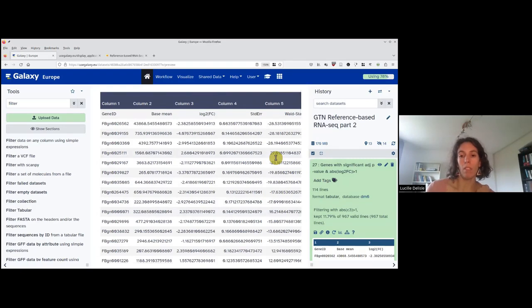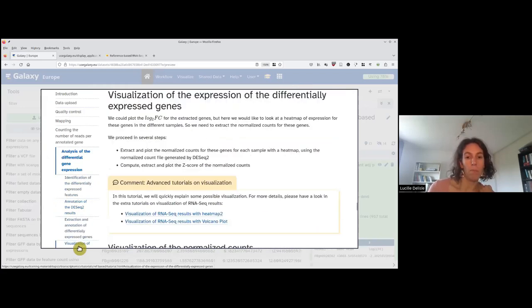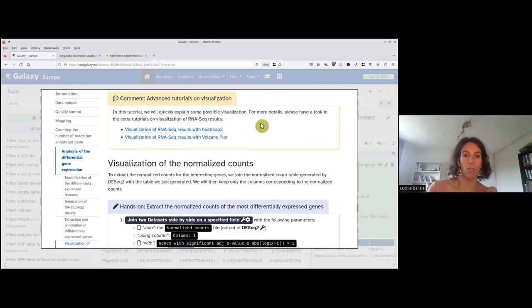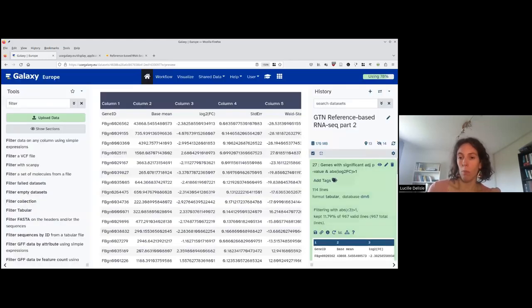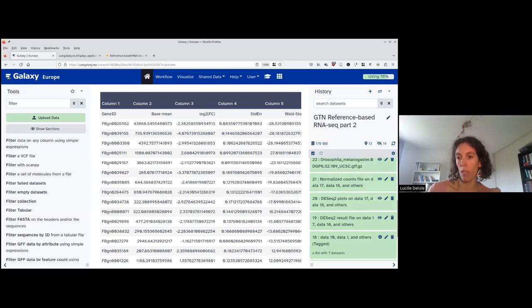We would like to visualize these genes using a heatmap. I go to the tutorial — we are now in the visualization section. There are two advanced tutorials on visualization you may be interested in: one uses heatmap2 (the tool we are going to use now), and another is about volcano plots. What we would like to do is visualize the expression in each of our samples for these ~113 genes. We have a table with all the expression — the normalized counts file — but it contains all genes.